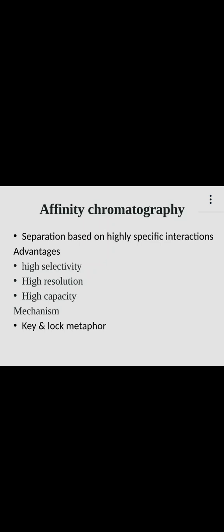So the stationary phase selectively retains analytes and can also be used to study biological interactions.